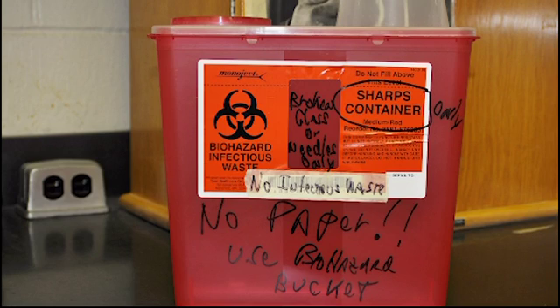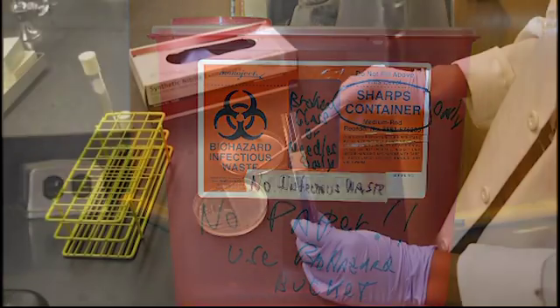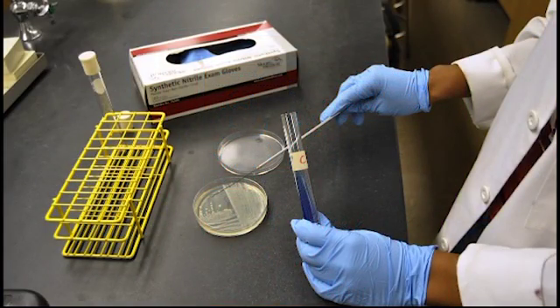Non-biohazard broken items should be disposed of in the appropriate sharps container unit. Biohazard and biologically contaminated sharps and broken glassware must be disposed of carefully in the biohazard buckets at the discard cart. Rule number 15. Approved gloves may be required when working with hazardous chemicals, dyes, or pathogens. Consult the lab instructor for more information regarding the use of gloves in the lab.